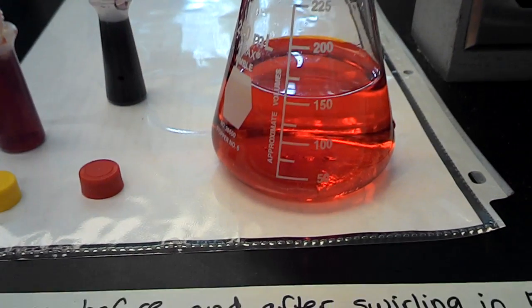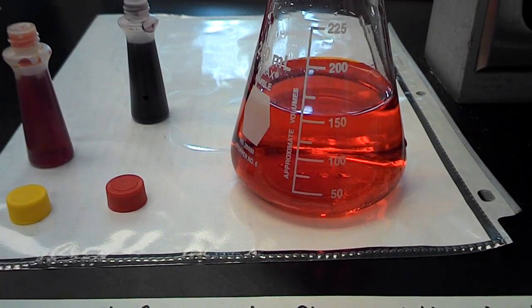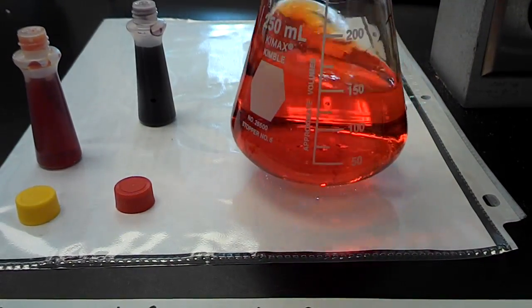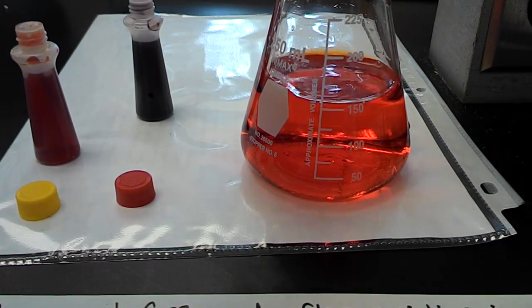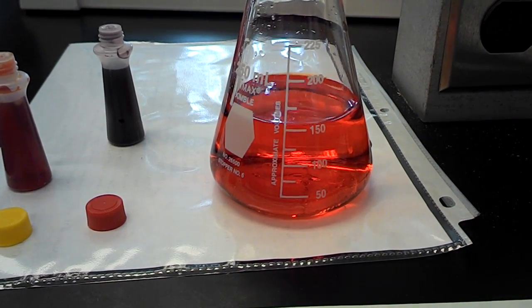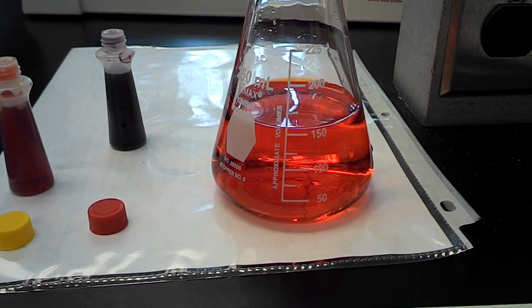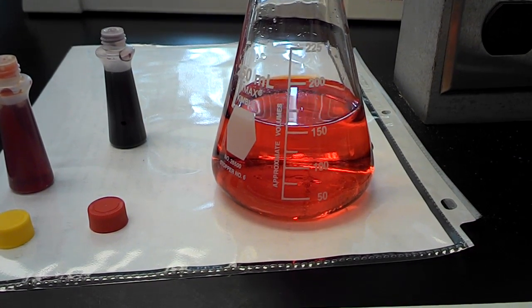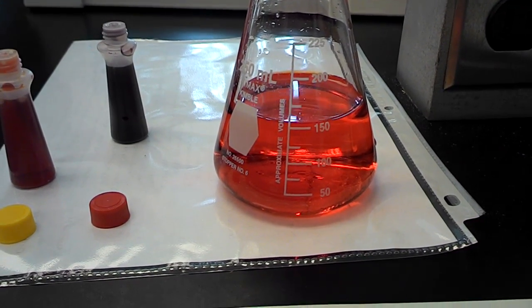Okay. I don't know if you can tell, but it's just dissolving. And then swirl. If you saw, there was some yellow. The contrast is not as strong here. It becomes a little more orange, so if you would expect red and yellow to become more orange, then that's a physical change. But if it's unexpected, then it would be a chemical change.